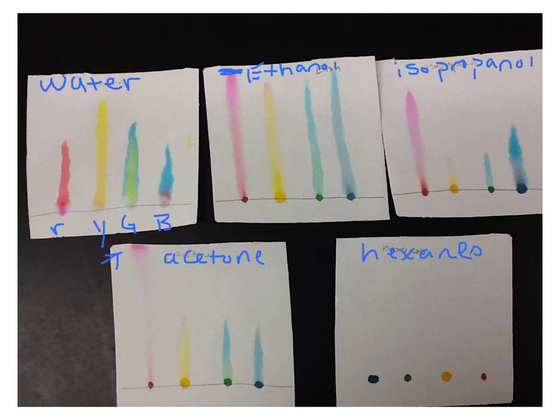So obviously, if we look at this, it makes sense that it doesn't like hexanes, because as you can see, with the hexanes, none of this traveled. Remember, the solvent is traveling up the paper, right? So you can see in hexanes none of these moved anywhere, which means this sample did not like the hexane solvent, okay? Which is no surprise, because if we go back and look at the structure, remember the structure of hexanes looked like this. It had no possible hydrogen bond. It can't hydrogen bond at all with our dyes. So it makes sense that it's going to want to stick to the paper versus moving up with the solvent.